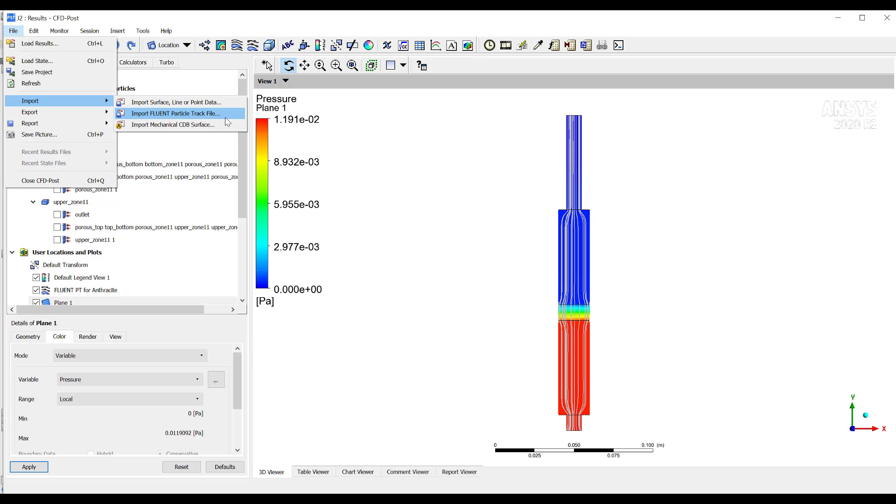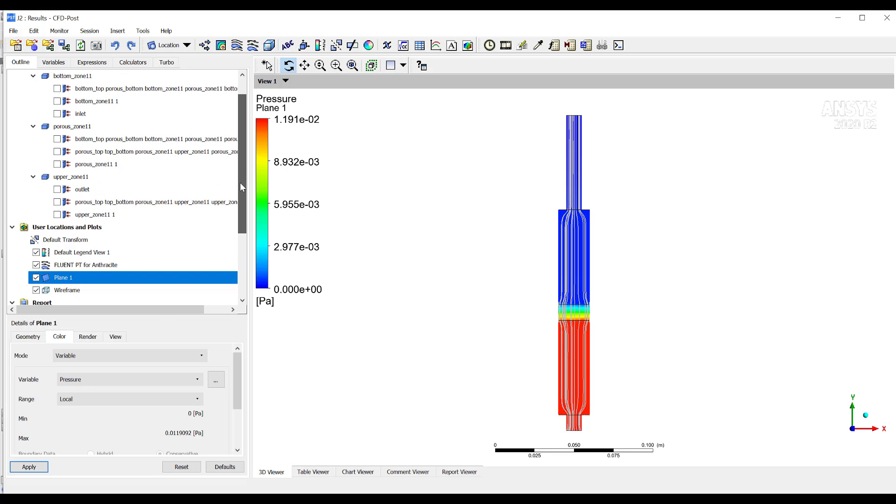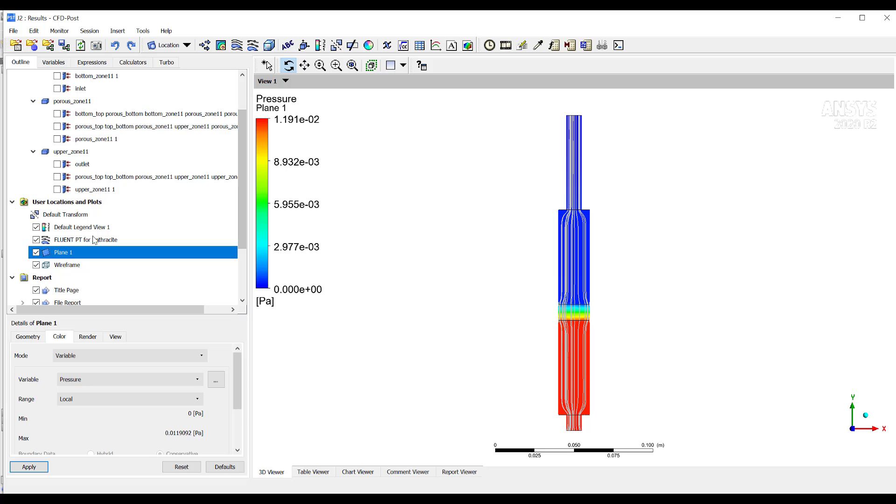Then I already imported it. Then once you import the particle track file, then you will see something like this. Then this is the particle track. If I uncheck it, then you see how the streamlines for particles disappear. If I enable it, they appear.